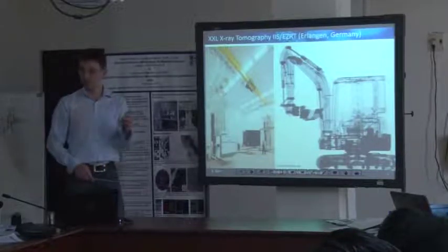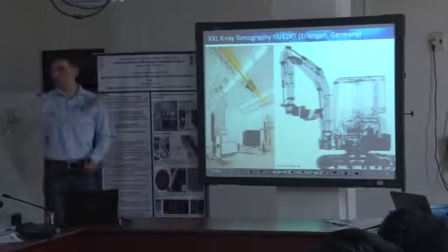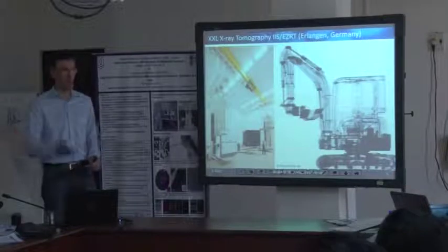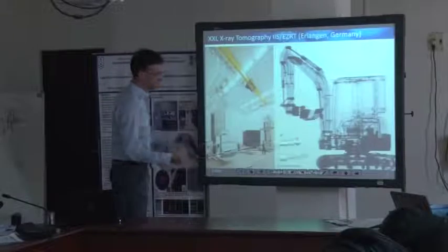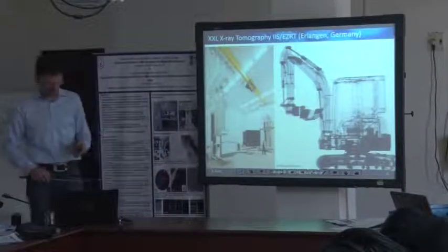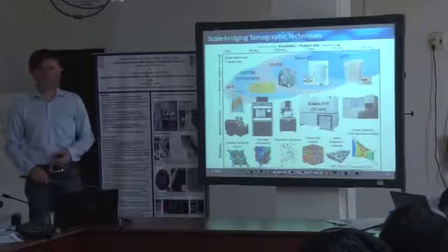This is not only 2D. For 2D, we have those at every harbor just to screen containers and trucks, but this is done in 3 dimensions. So pretty huge objects can be investigated. But let's have a look at where electron tomography is.